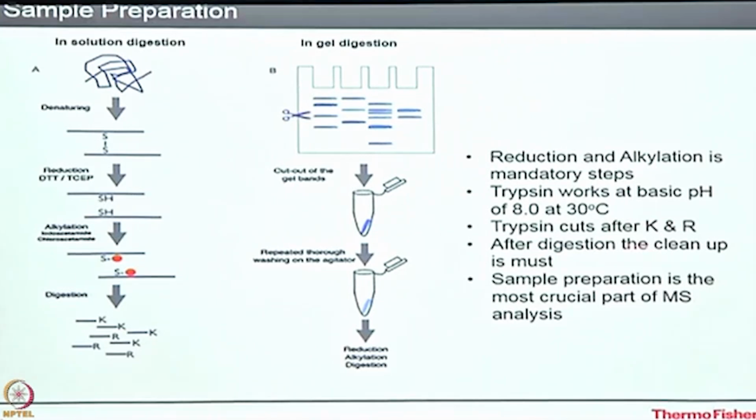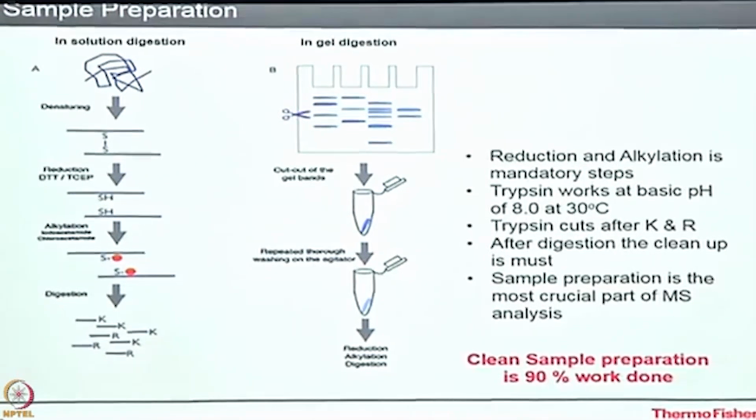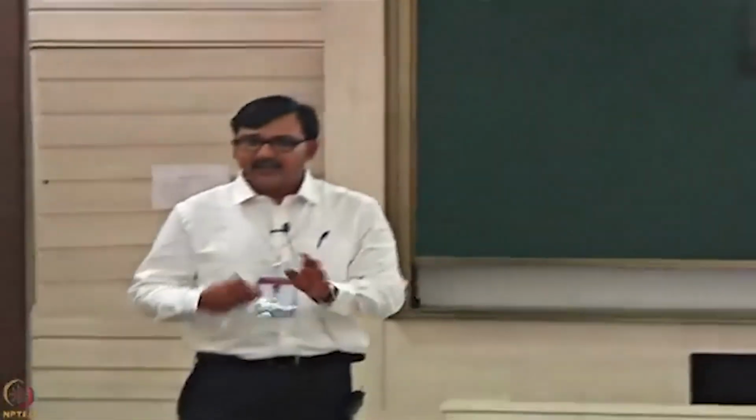So sample preparation is the most crucial part, and if you do a proper sample preparation, your 90% work is done. The rest is basically software driven, so whatever you set in the software, it will do, but sample preparation is the most crucial part for you.